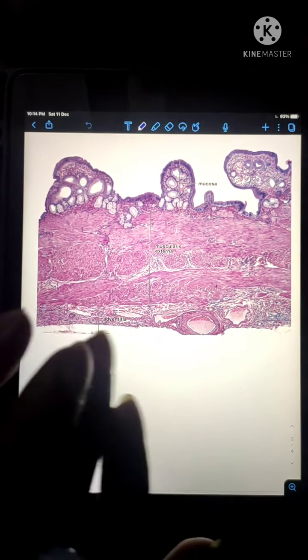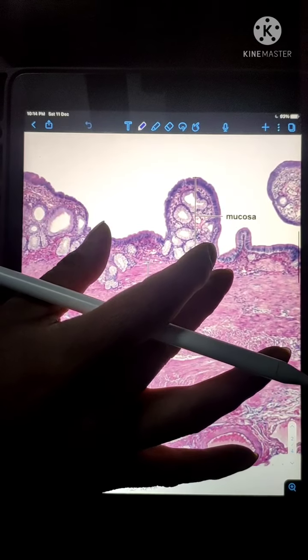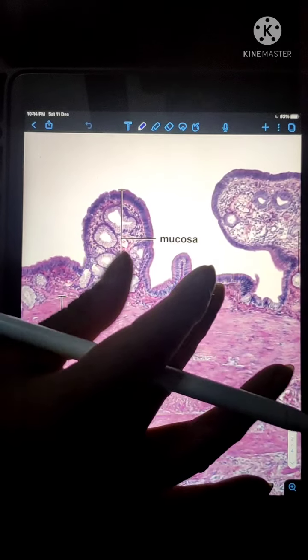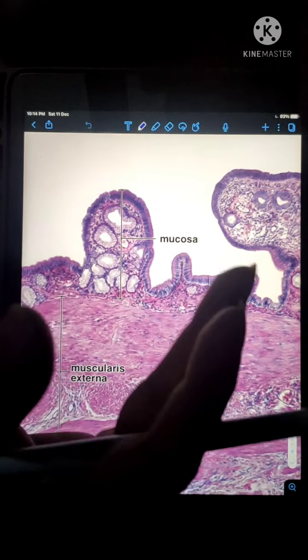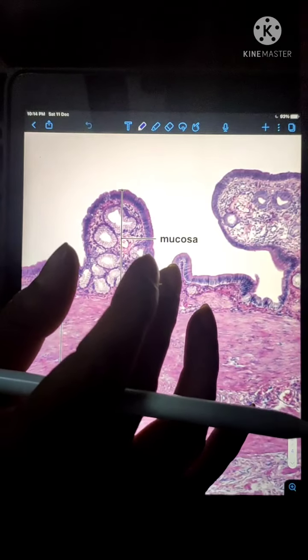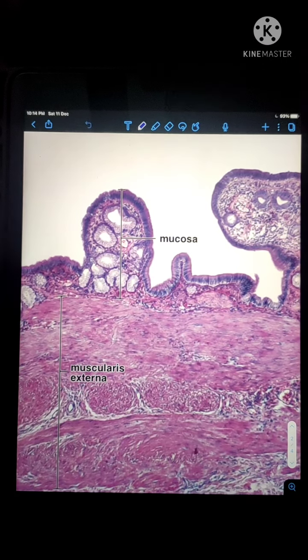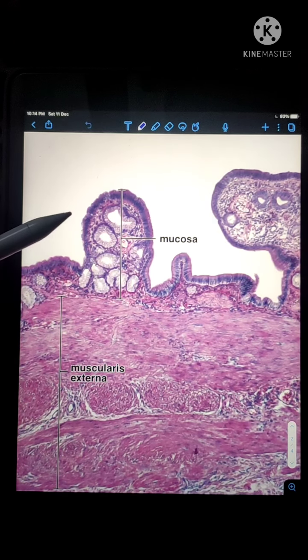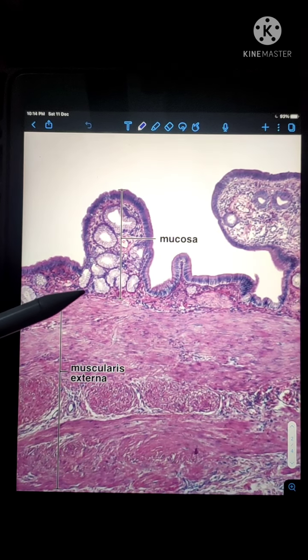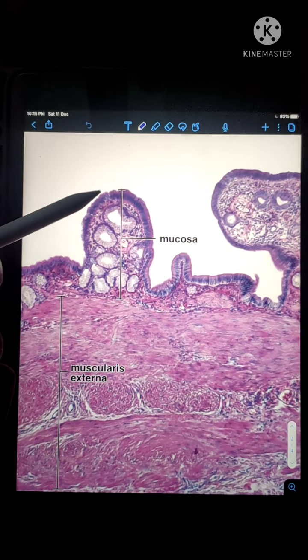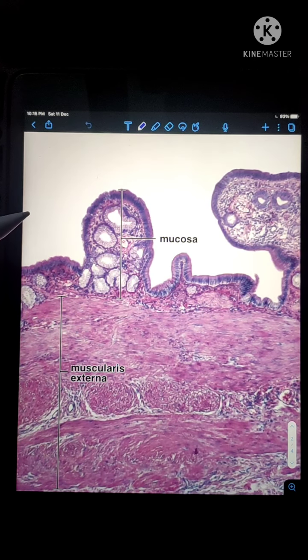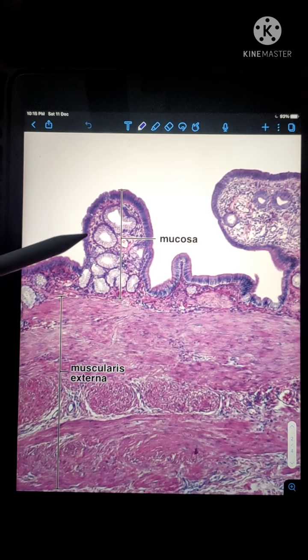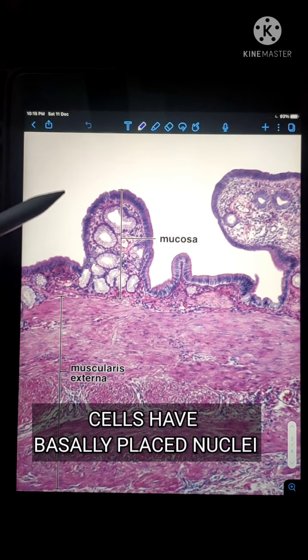Now let's talk about the mucosa. At first glance, the main thing that comes to our notice is that the mucosa is thrown into many folds, which may sometimes resemble the villi of the intestine. However, these folds are present only in a partially distended or empty gallbladder. In a properly distended or full gallbladder, these folds are not very conspicuous.